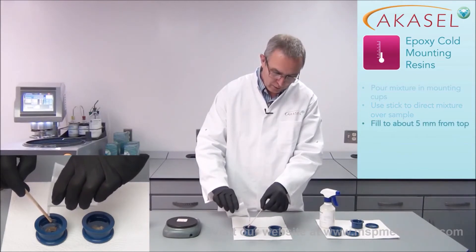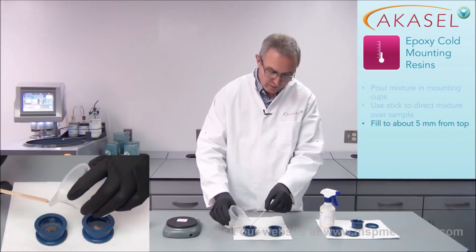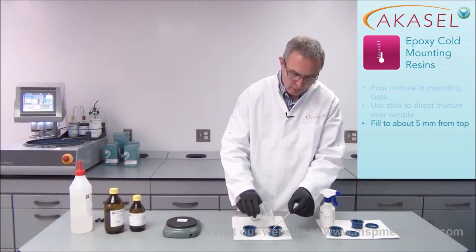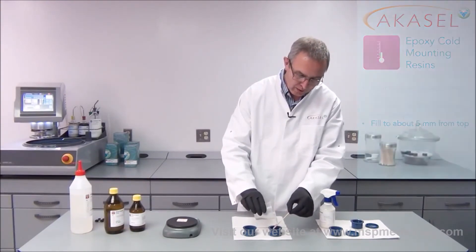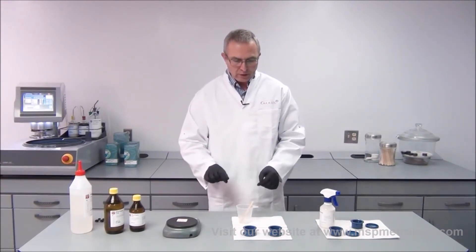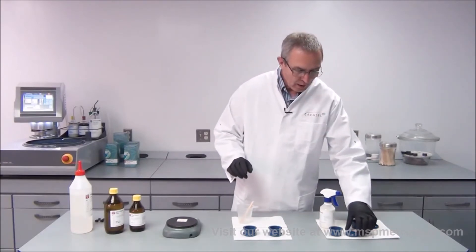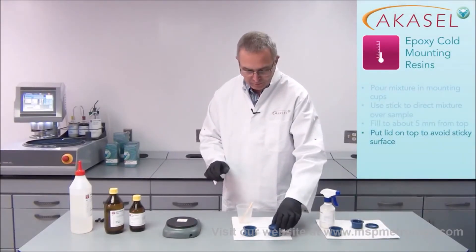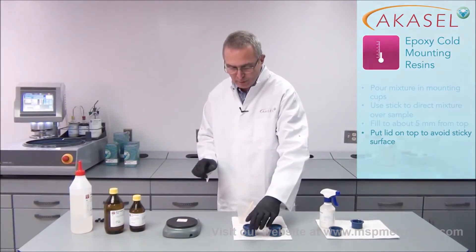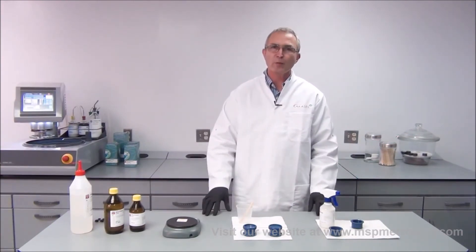I'm only going to fill the mounting cups to about 5 millimeters from the top. That makes them easier to remove and gives better preparation results, because the samples should not be too high when grinding to avoid penciling. I then put the lid on to cover the mounts, which prevents the surfaces from being sticky. After 8 to 24 hours, the samples will be ready for preparation.